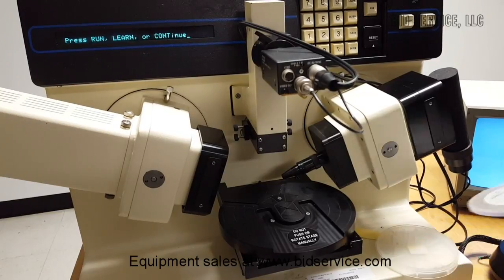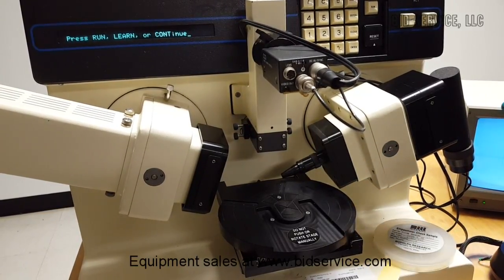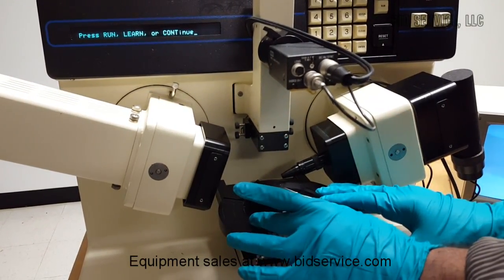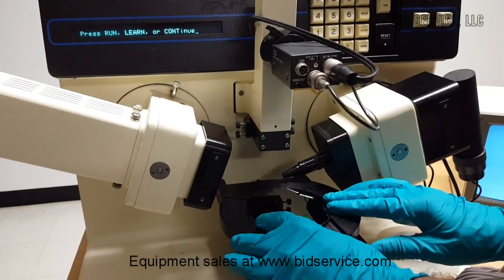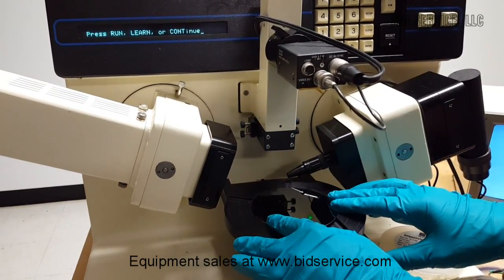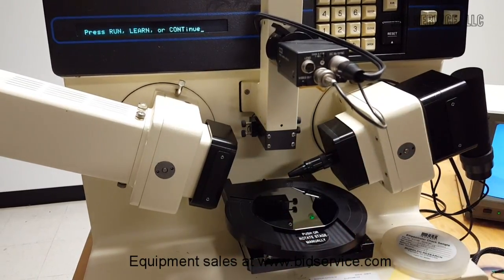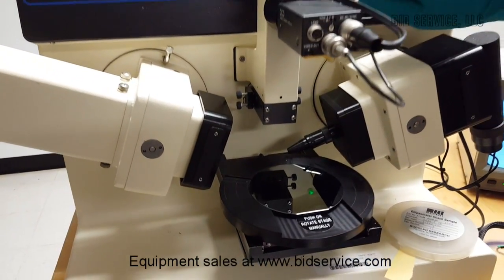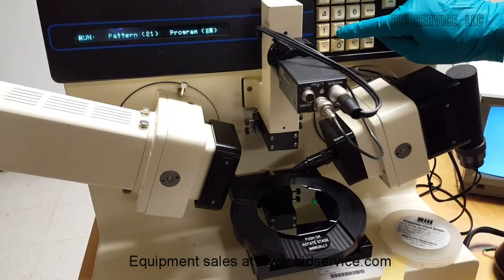So this standard is approximately 2236 angstroms. It's a Rudolph standard. There are grooves on the chuck, and once you place the wafer in the center of the chuck and press run, and here again I use another program, program number 21.